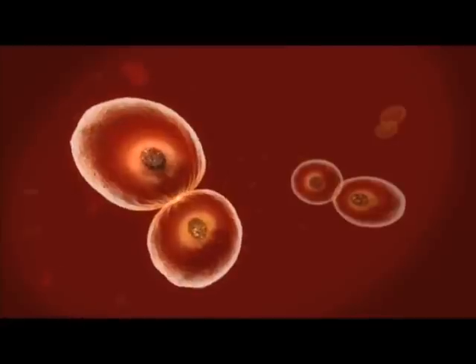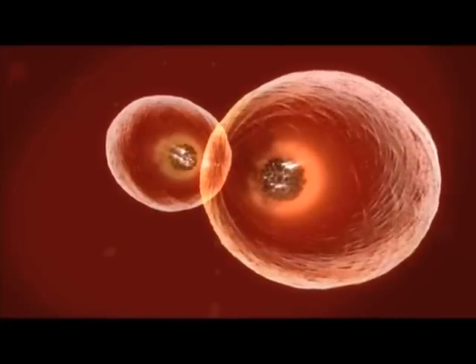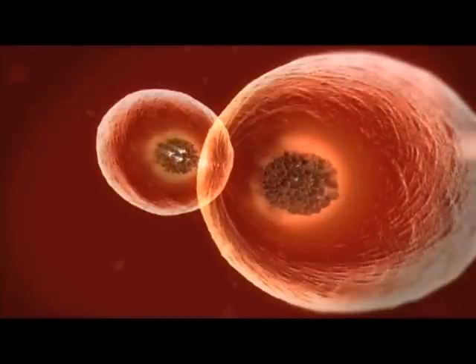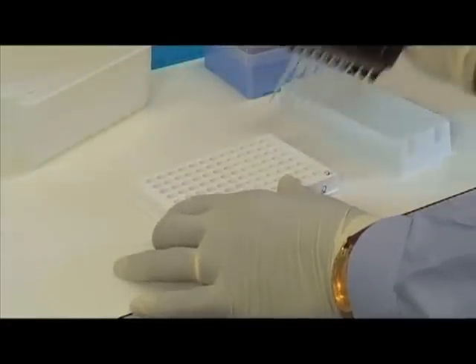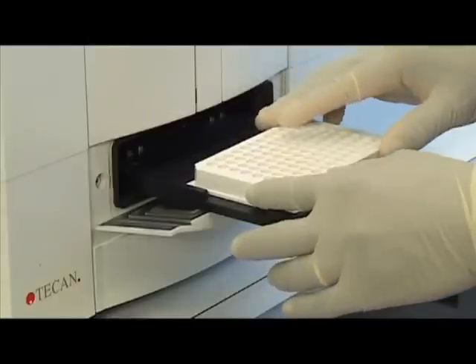There is a luciferase gene that has been inserted into the virus. So as the virus replicates or grows in cells, it produces this gene. It's a bioluminescent gene, so it gives this color, and we could use that as the end point of the assay. And so you have an assay that's both qualitative. Yes, the virus is growing because light's emitted. No, the virus is dead because it's not emitting light. And at the same time, you can also do it quantitatively, how much light is emitted, so that you can know whether or not a lot of the virus has survived in a particular syringe or just a little bit.